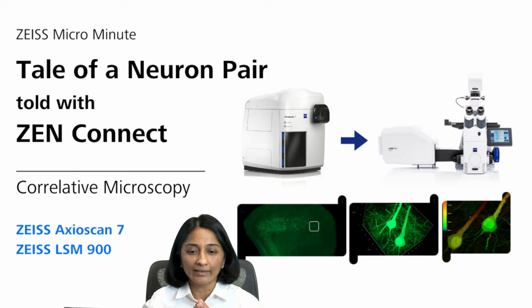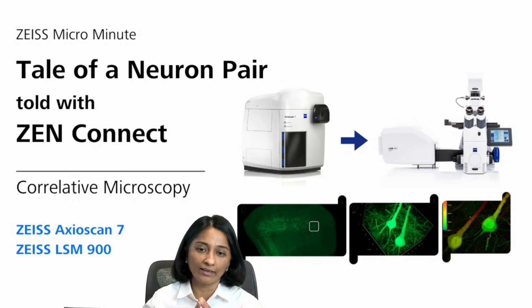I'm going to be talking about correlative microscopy today, and the topic is very exciting to me because we are surrounded by microscopes here at ZMCC.